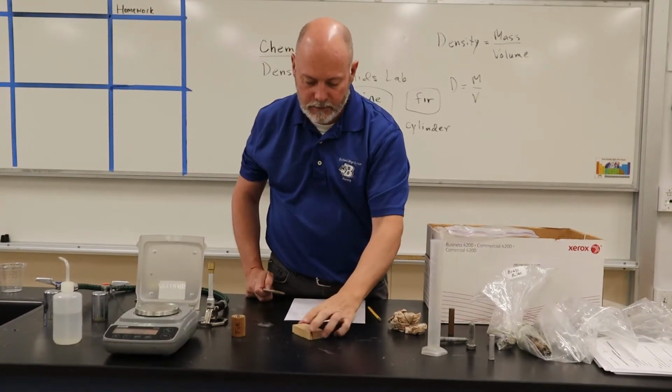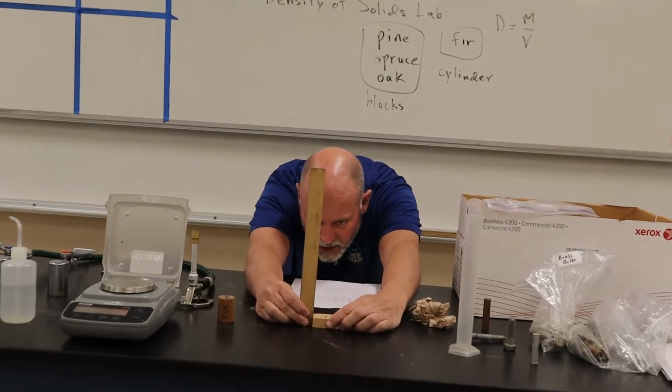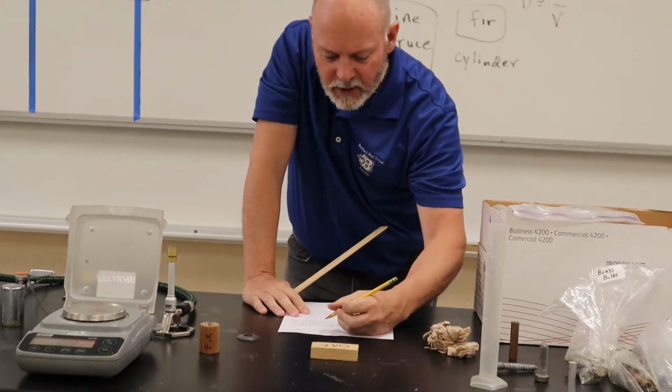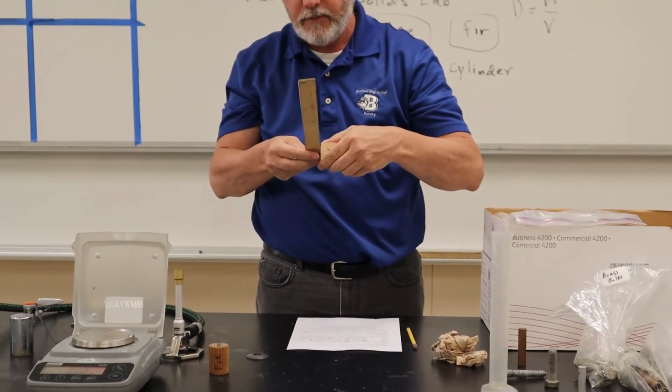Same thing. Up is 1.7 centimeters, so 17 millimeters, sorry. So 17 millimeters or 1.7 centimeters. Let me double check that, yeah.